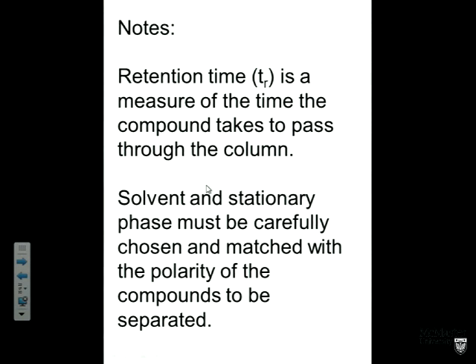Sorry, in the graph that you showed before, the detector could be detecting just about anything. It might be UV absorption, ultraviolet absorption, right?